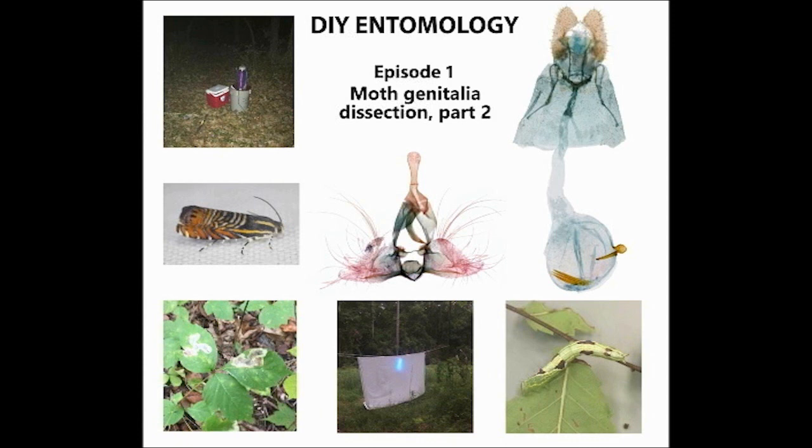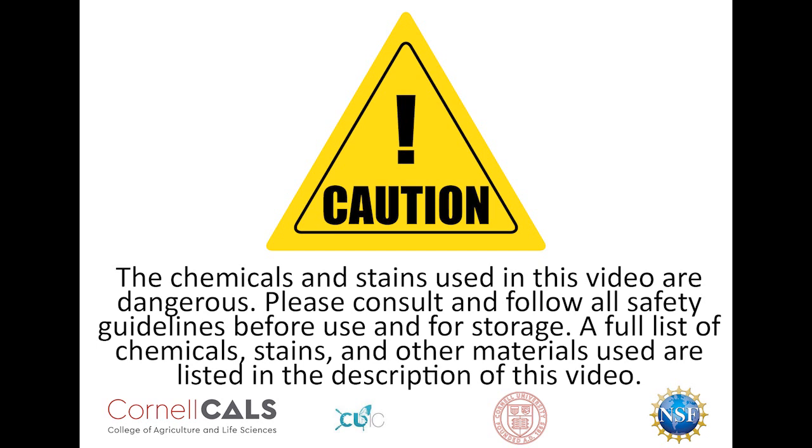In the previous video, I showed you the first steps in moth genitalia dissection. In this video, I will show you some optional extra steps, including staining.